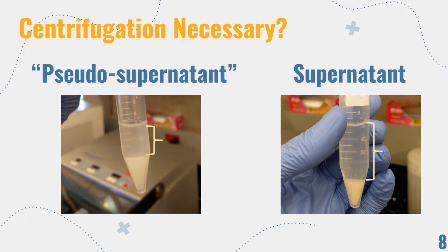supernatant. Samples were taken from each type of supernatant and used in one of two purification and concentration methods, to identify and quantify proteins and metabolites. The pellet seen in both images was not used in our samples because it contained mostly cellular debris and bacteria, which was not of our interest.